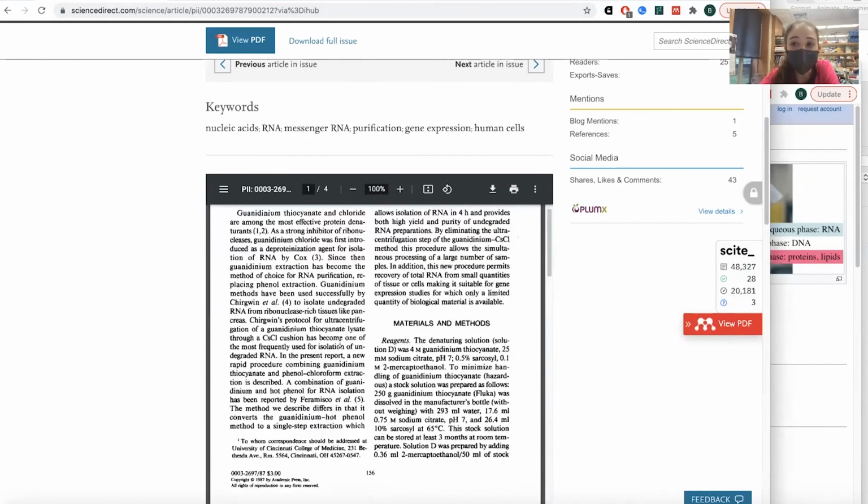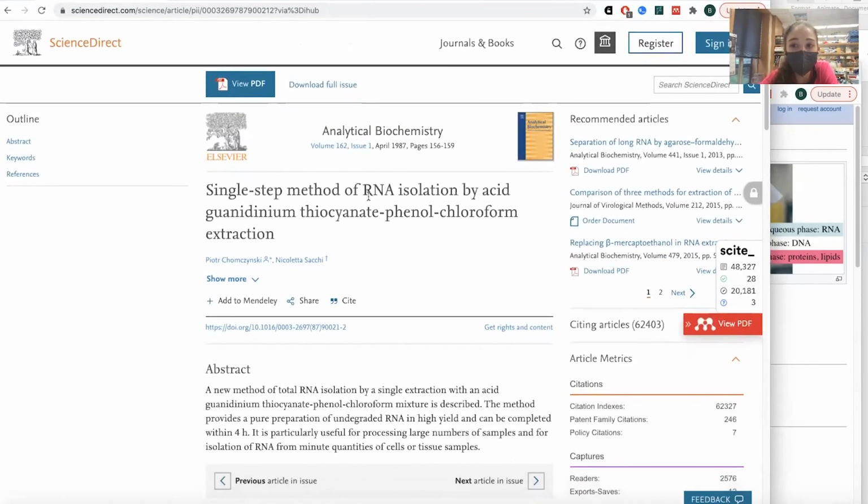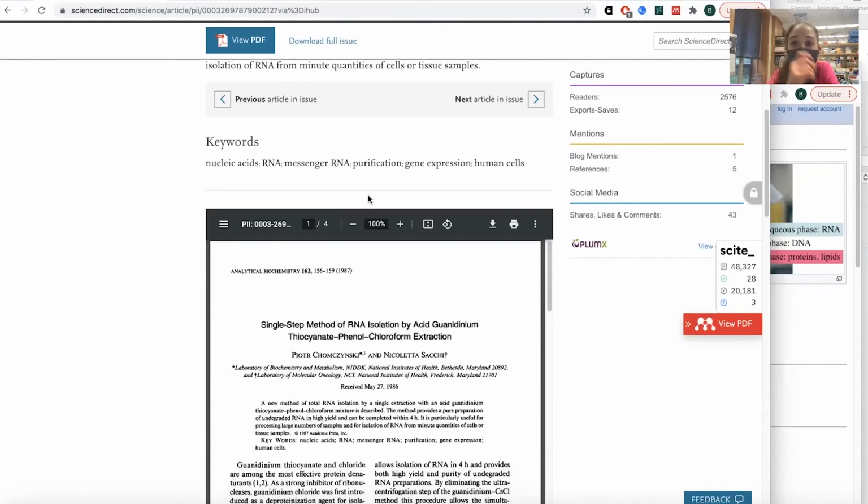There are other methods as well. There are a lot of easier methods like kit-based methods, which use spin columns, kind of like you might have seen with mini preps or PCR purifications. Those are easier, but they tend to give you a lower yield and potentially less product. Depends on how you do things. But that's just what I've read, and it's also less suited for various purposes. But definitely look into it, and then you can find all the information. You can make all these reagents yourself.